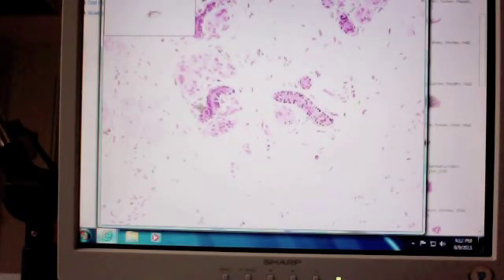So what kind of gland is this? It's a coiled gland, and we know that this is a simple coiled. In this case, simple is kind of superfluous because coiled glands usually are simple glands. But this is a simple coiled tubular gland. Again, it's a single tube starting at one end, one tube, highly coiled.